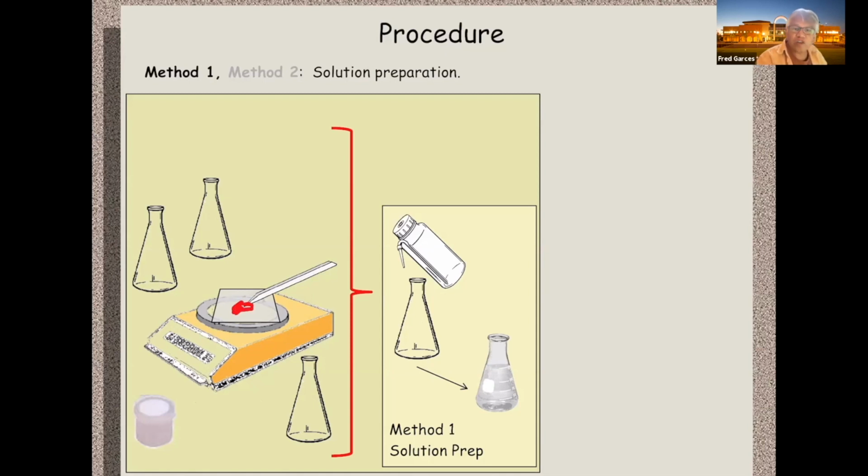So adding water does not change the mole. Yeah, it changes the concentration, but you're not worried about the concentration, because at the equivalence point, the moles of the base equals the moles of the acid. You're only worried about the moles. Okay, so adding water here, whether you use 20 mils or 28 mils, it doesn't really matter. Your moles is fixed based on the mass.